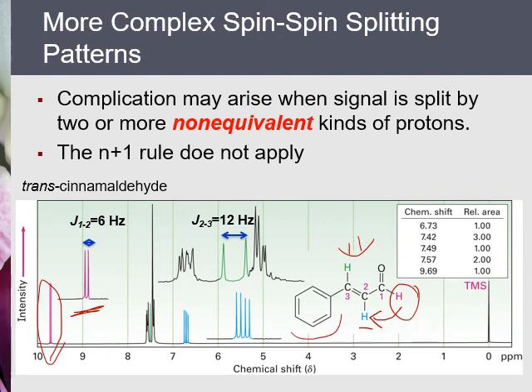The aromatic hydrogens have a range from 7.5 to 8. If you enlarge this range, you see a doublet, and this doublet is actually due to this green hydrogen, the other vinyl hydrogen. This vinyl hydrogen appears as a doublet because it couples with the blue one.